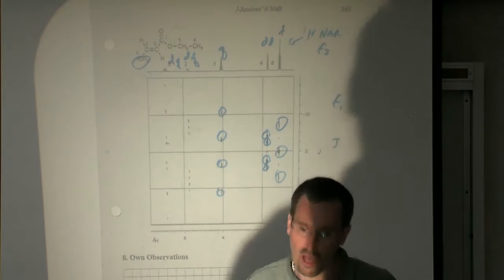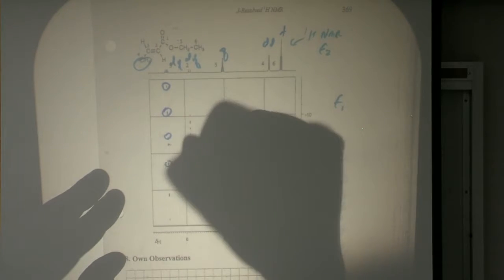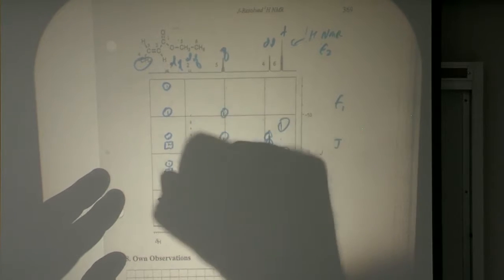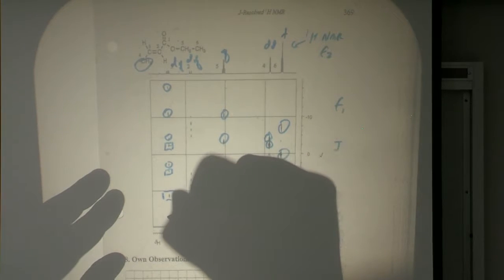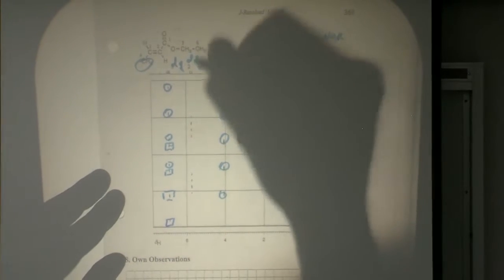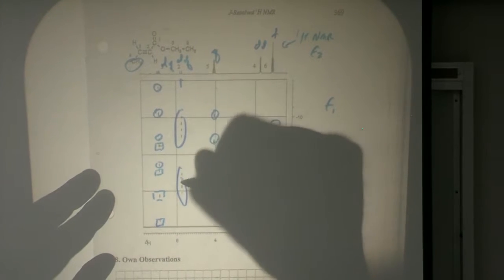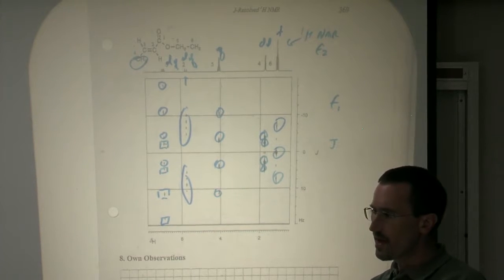And you can see your lines. So you go 1, 2, 3, and 4 is one quartet, and 1, 2, 3, and 4 is the other quartet. And then here you have another doublet of quartets, and you can see your quartets here. So put that away in your toolbox for cases you may need it.